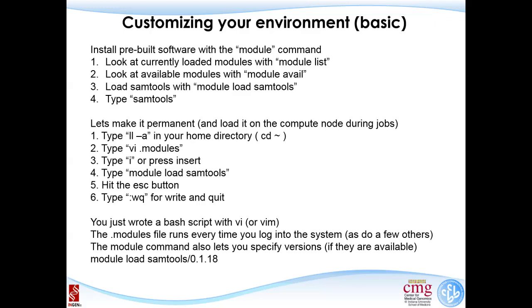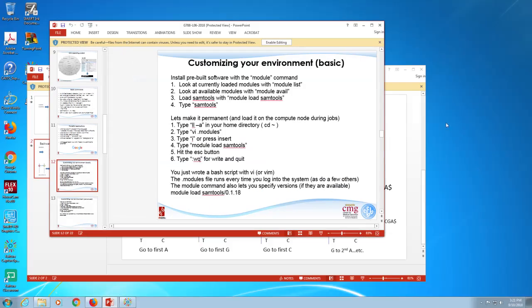So the first thing I wanted to do here is show you guys how you look at software that's already available on Karst. How can you use a tool that you don't necessarily have to install? Because most of the NGS tools that we use, we've actually requested Karst to host. So the basic stuff is pretty much available already. You don't have to go through a lot of steps to do this. So let me just quickly log in and show you what I'm talking about.